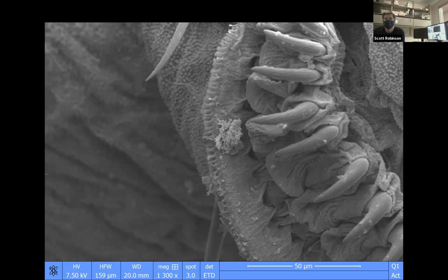When we're doing scanning electron microscopy, we're looking at something from the outside. When we're doing transmission electron microscopy, we're looking at the insides of things, and that's how we see inside of cells. That's how we see the mitochondria and the nucleus and all the little pieces of the inside of a cell, and little cilia and things like that. So I help with transmission electron microscopy and scanning electron microscopy. And to make all of those things work, we have all kinds of prep equipment like ultramicrotomes and diamond knives and sputter coaters for putting gold palladium on the sample.